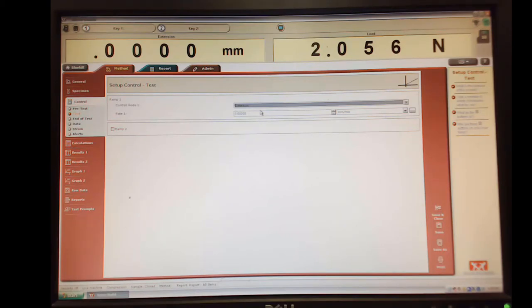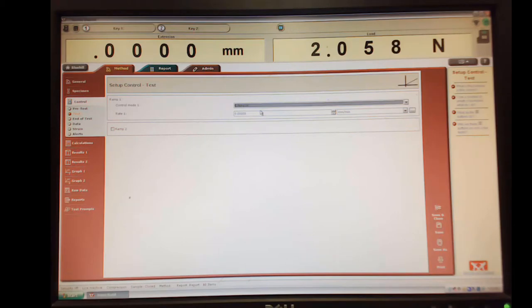Because all we need is we're just fitting that linear part of the curve. So I think one millimeter of bending over a minute, that sounds pretty good.